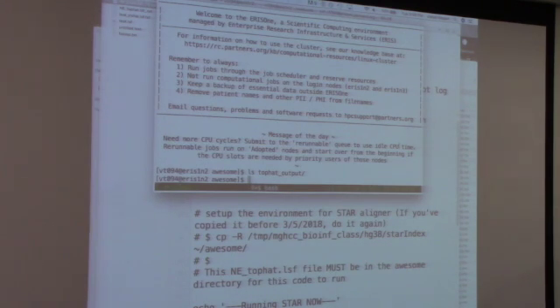Did it run? Yes, I already see it. Type it correctly in the box: bsub, space, -q, space, normal, space, then the file. Now hit enter, and it should say it's been submitted to your queue.